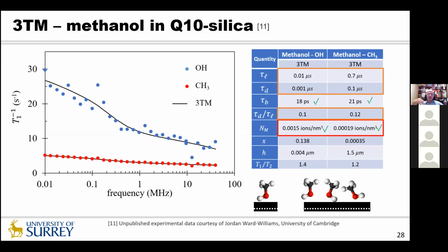Now, I've seen some molecular dynamics simulation of small alkanes in the past, and these small molecules sort of sit at the surface. They wave around somewhat, but they're not hopping across the surface. And so my picture is this, where tau L is much longer than tau D. So I'm thinking that probably this tau D over tau L ratio is right, and it's just indicating that.